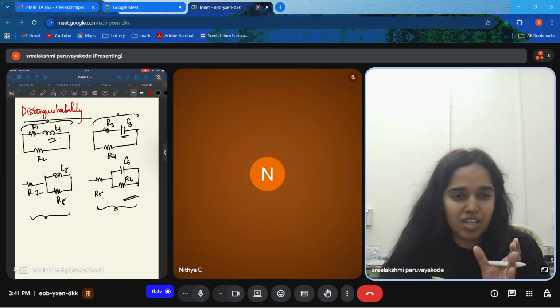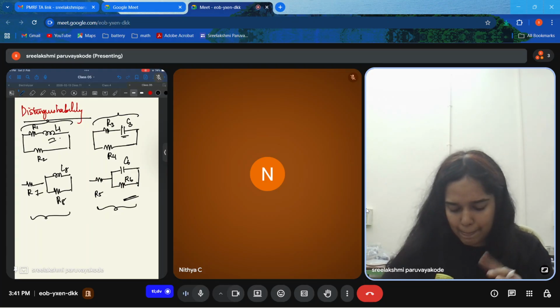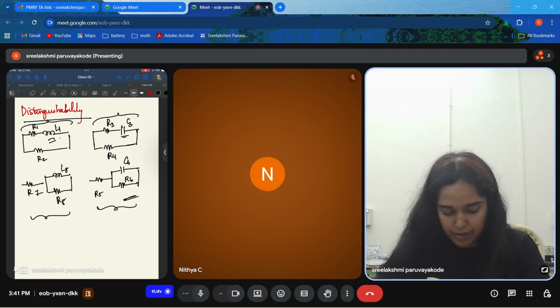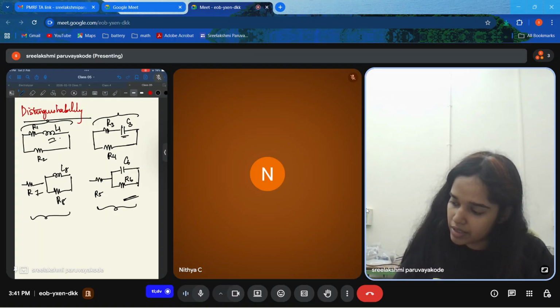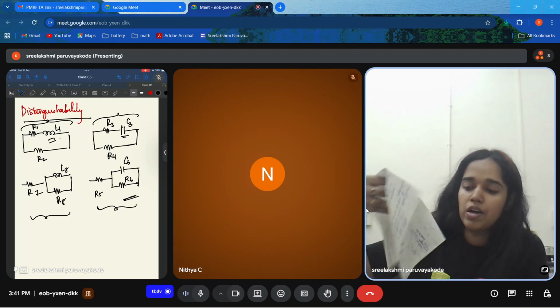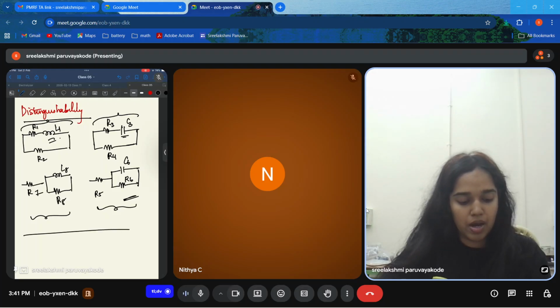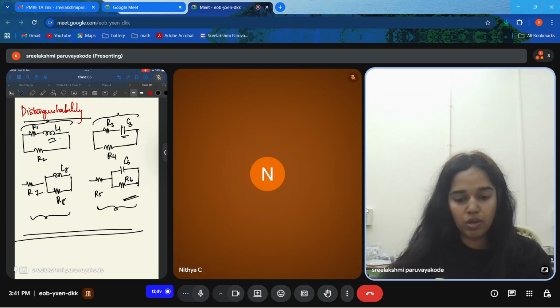So by using that condition, we'll be able to bring out some relation between the elements used here. I told you the values will keep on changing; they're not the same. In order to study that, before that, we should also know what is RT and what is RP. One is the charge transfer resistance and one is the polarization resistance. This part I'll be explaining once I'm solving the assignment questions, which I'll be doing in a couple of minutes ahead.